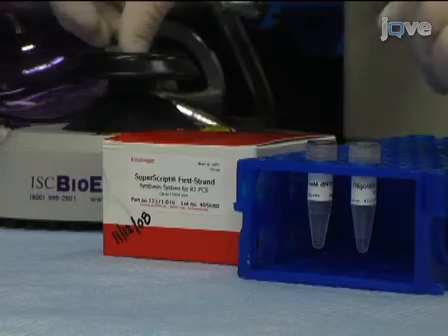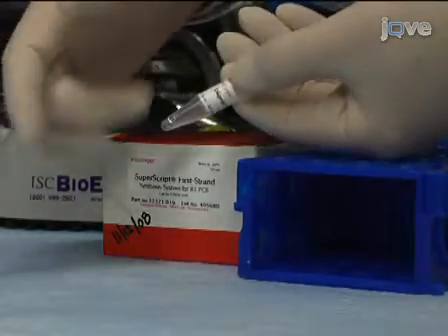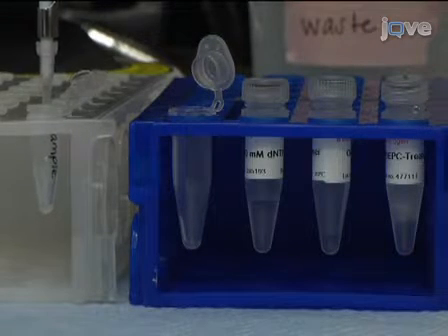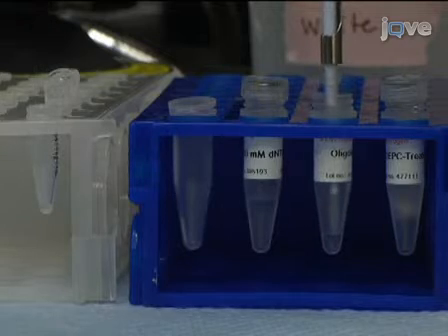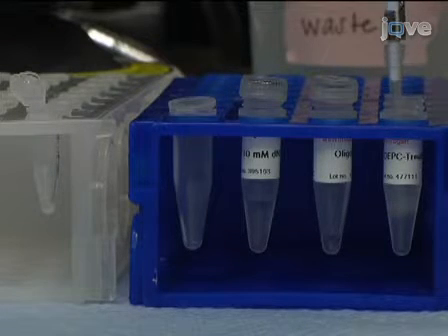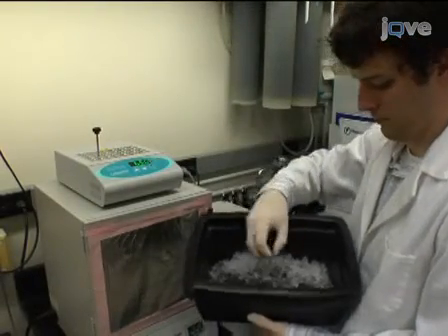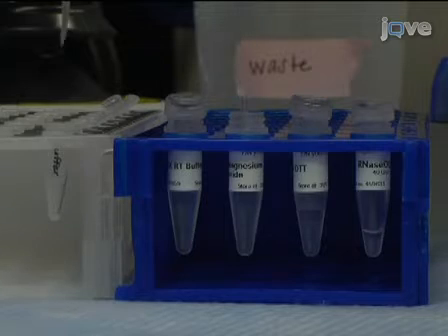Start the cDNA synthesis by mixing and briefly centrifuging each component of the RNA primer mix: the RNA, dNTPs, and oligo-dT. Add each component to a sterile 0.5 milliliter microfuge tube to a total of 10 microliters. For specific volumes, see the accompanying written protocol. Then incubate the sample at 65 degrees Celsius for 5 minutes. Immediately transfer the sample to an ice slurry for 10 minutes. While the sample is cooling, prepare a buffer master mix to a total of 9 microliters as outlined in the accompanying written protocol.